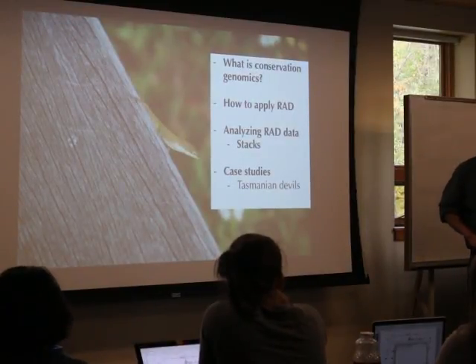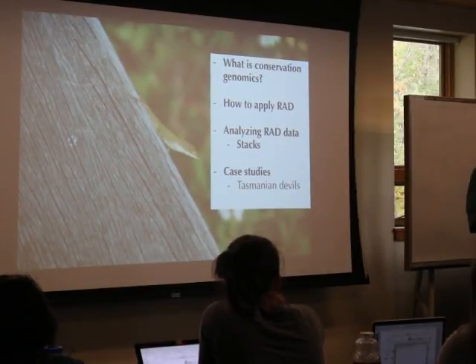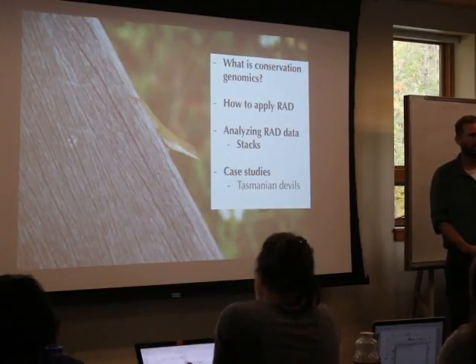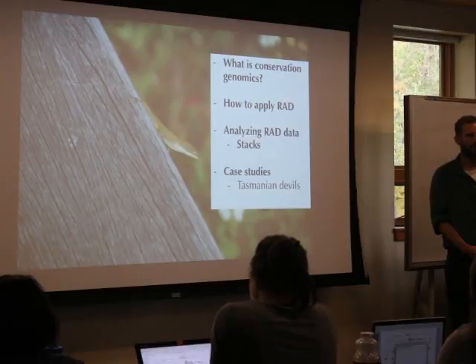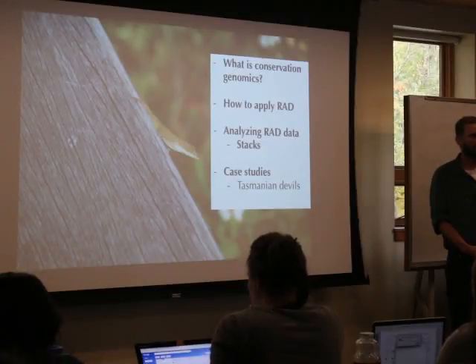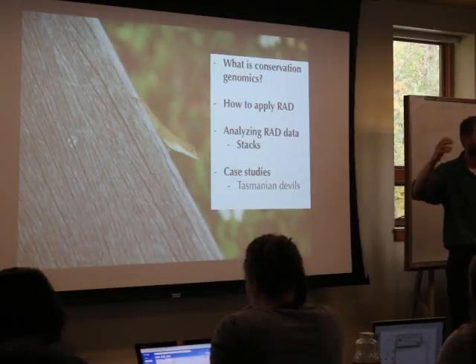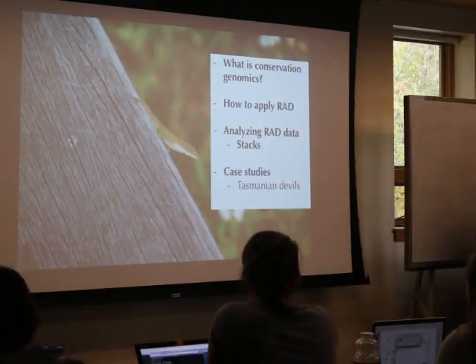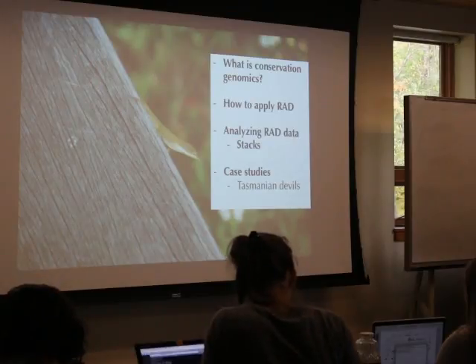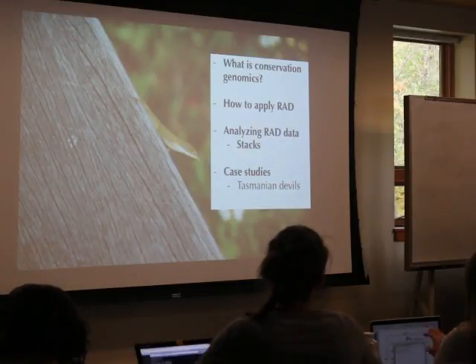So, RAD sequencing data, as we've been talking about all day, has certain characteristic features, and there are a few different software packages out there for dealing with it. Just to give a little bit of history, like Mike said, he and I were both at the University of Oregon together when the RAD protocol was being developed. Mike was a central player in actually coming up with the molecular biology part, and I was just there tagging along trying to analyze the data.